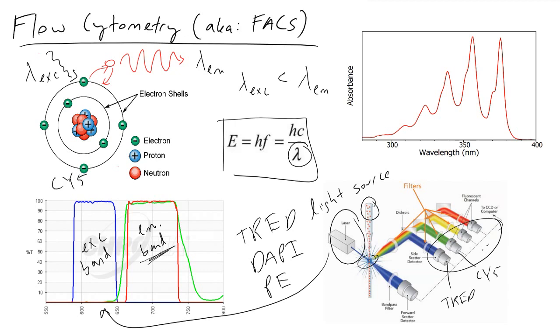A final thing that I wanted to talk about here is that when you see people talk about fluorophores, very commonly they'll tell you, oh, lambda excitation is equivalent to 350 nanometers. And even though they say 350 nanometers, and this seems like a single wavelength of light that will be emitted from a particular sample, specifically I want to actually not look at the excitation, but I want to be looking at the absorption, or an absorption is excitation.